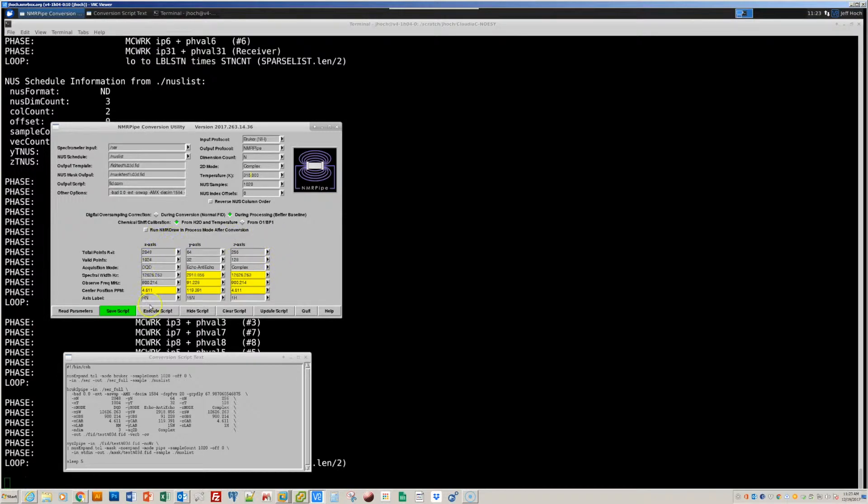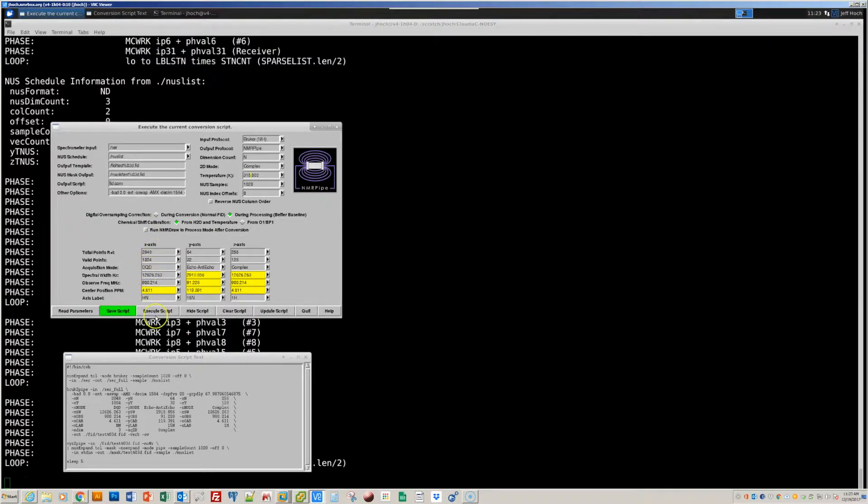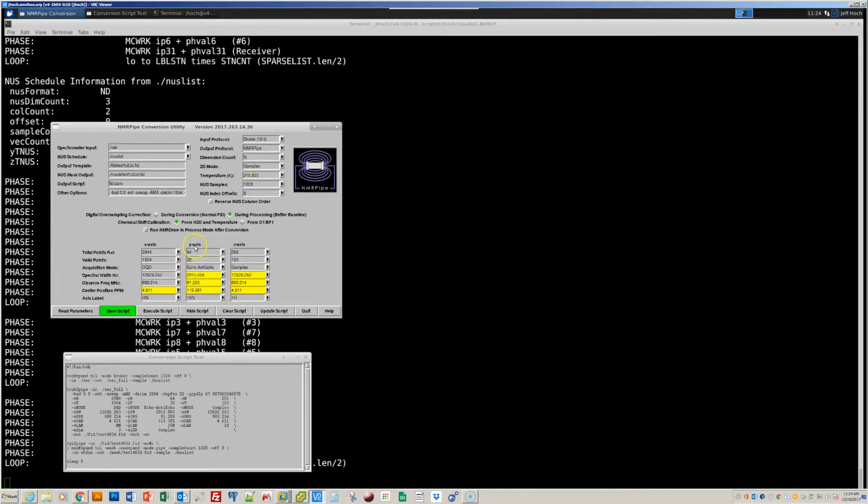Sometimes these parameters need other adjustments. The ones that we need to pay attention to are highlighted in yellow. In this particular case, the parameters are all set up nicely. Basically, we have the amide proton directly detected dimension, the intermediate dimension that we call the y-axis in NMR pipe. That's the N15 dimension. And then the final axis, the z-axis, is the indirect proton dimension of this NOE experiment.